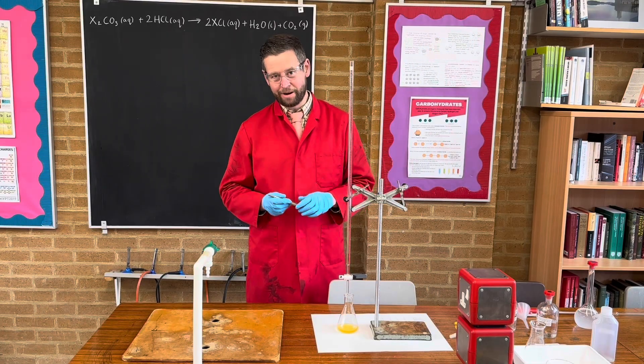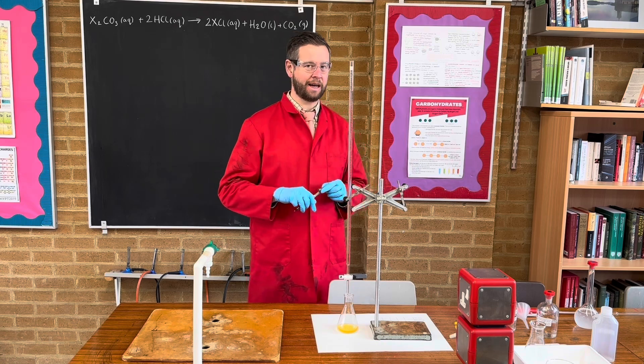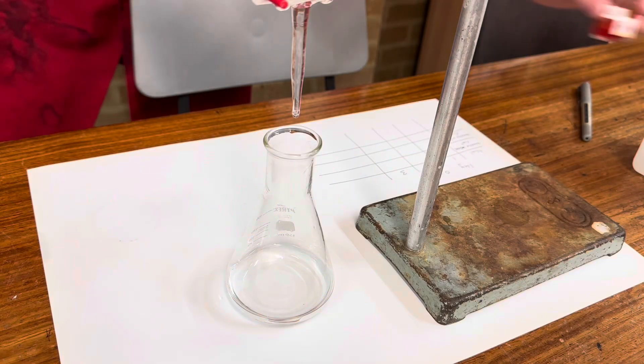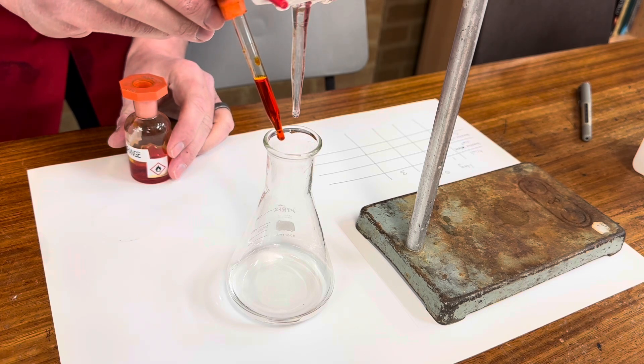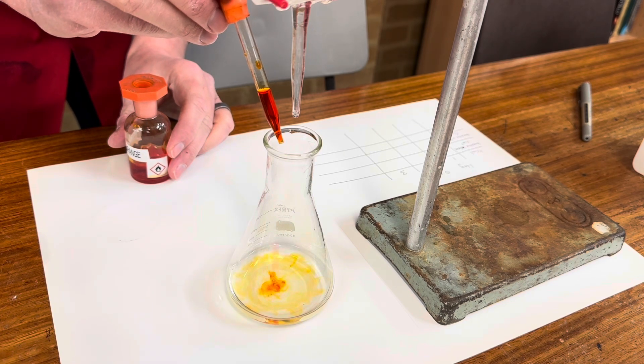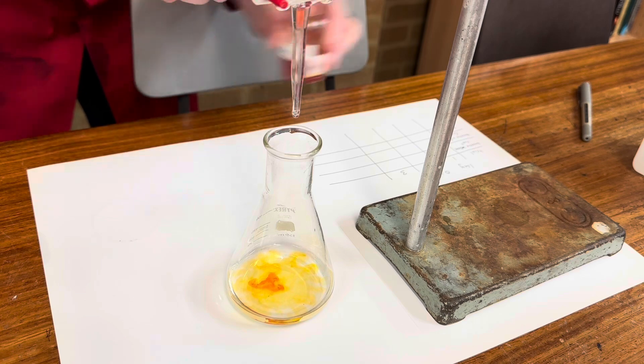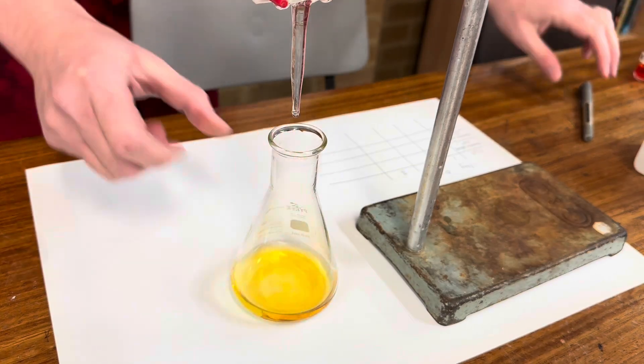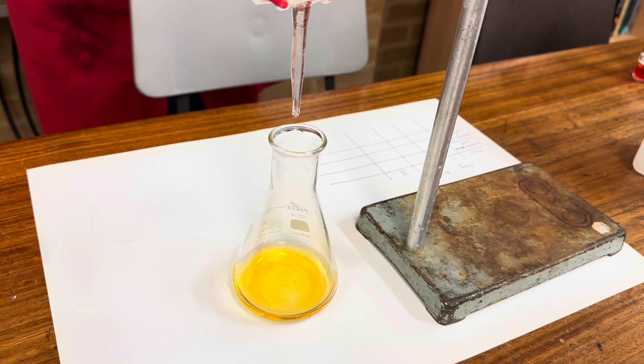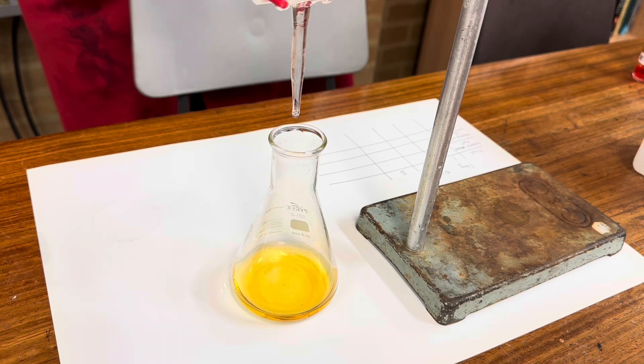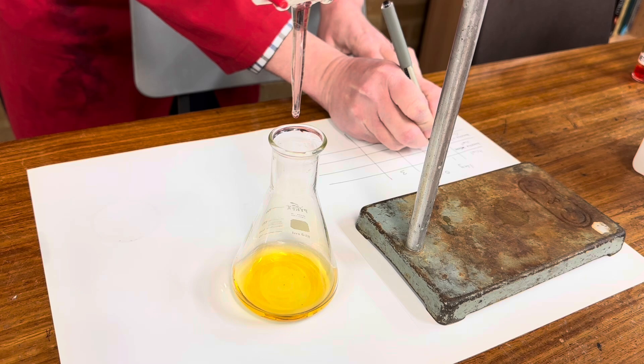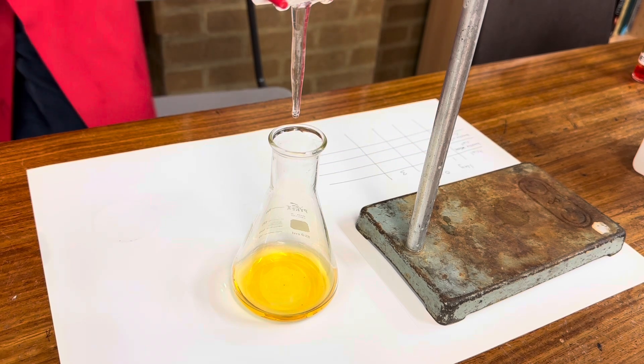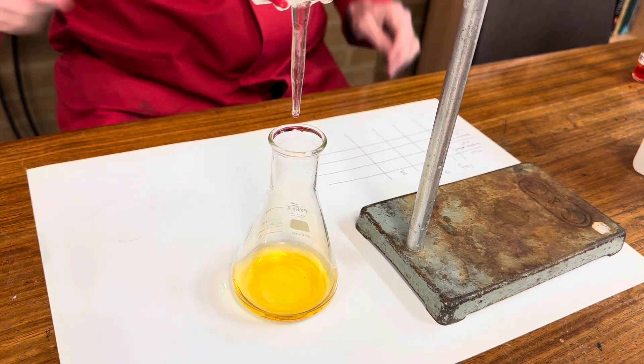Preliminary try over. We're now ready to do our first run. We'll add to this three drops of methyl orange. Give it a swirl. And record our first volume, which on this is 0.60. Let's titrate.